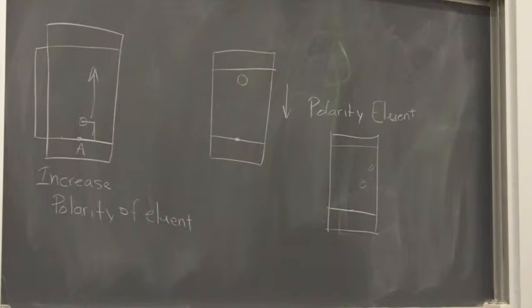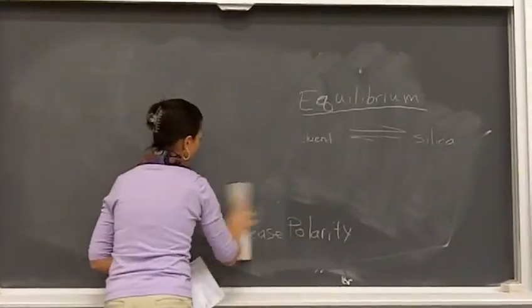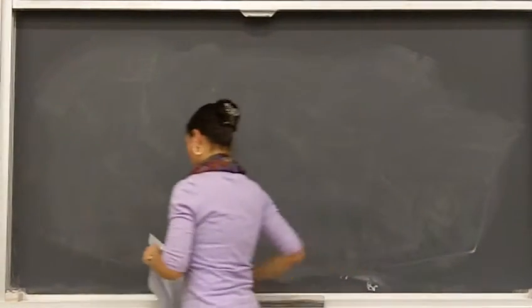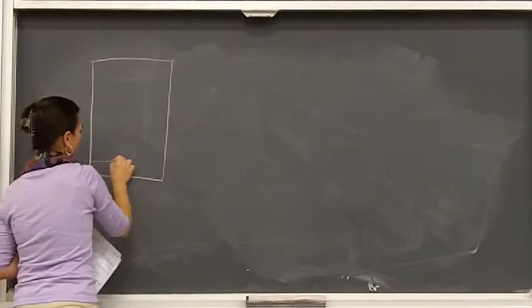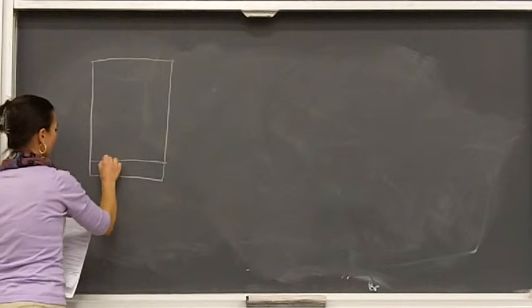Now as far as your experiment this week, there's multiple places where you're going to want to spot a TLC plate so you can see what is going on with the reaction. And I talked about this reaction goes really quickly. So probably as soon as you spot it, it will already be taking place, all right?